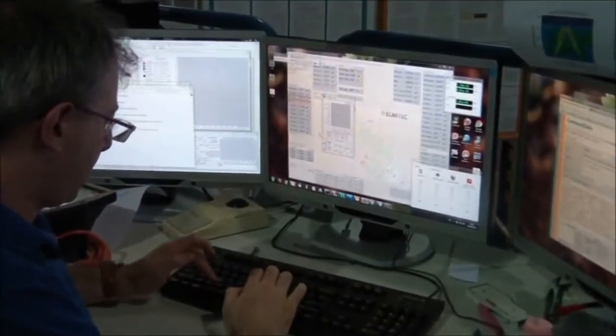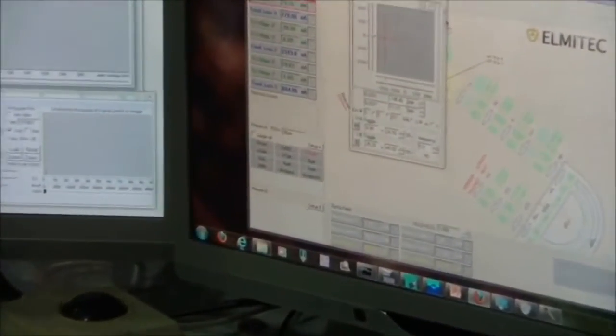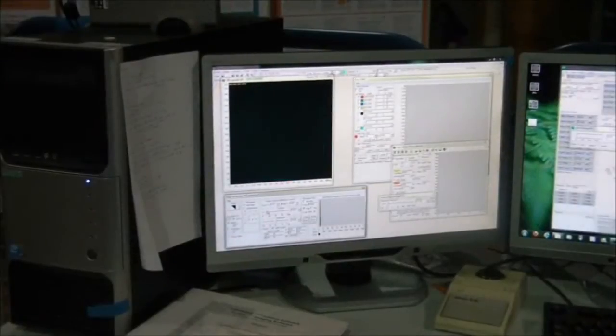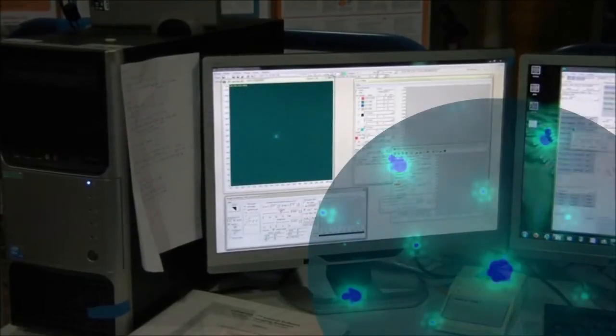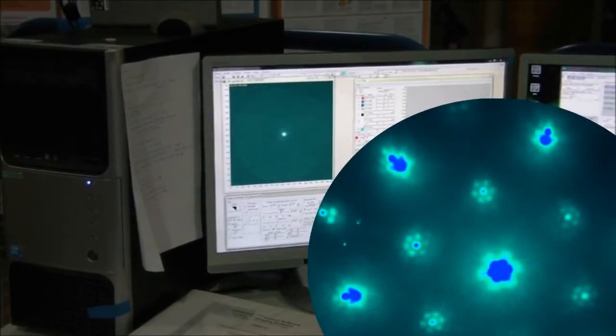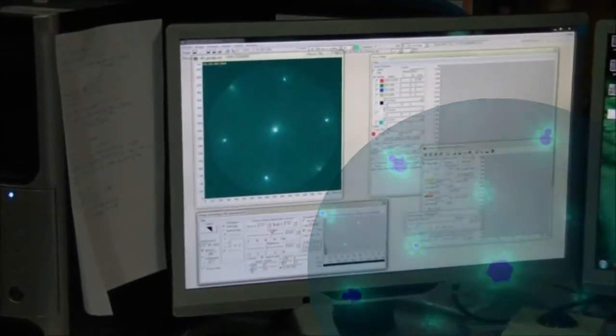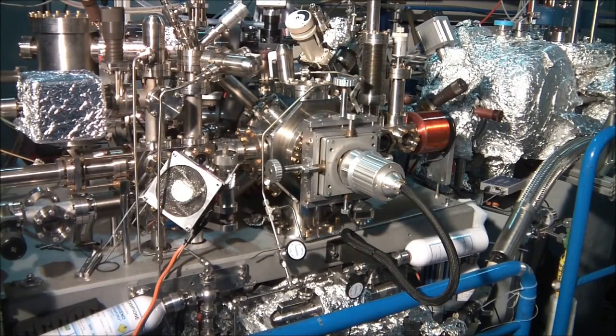Besides imaging, the SPELEEM instrument can also perform microprobe diffraction from micro-sized regions, selected using suitable field-limiting apertures. The microscope can be switched from imaging to diffraction within seconds. Researchers are thus able to observe the low-energy electron diffraction pattern or the angle-resolved photoemission pattern from tiny, microscopic regions, depending on whether X-rays or electrons are used as probe.